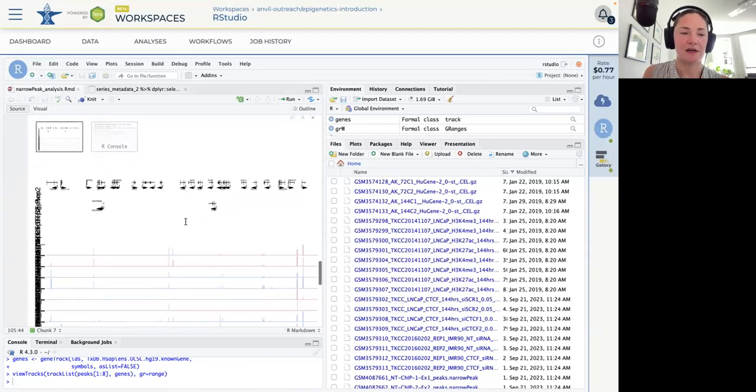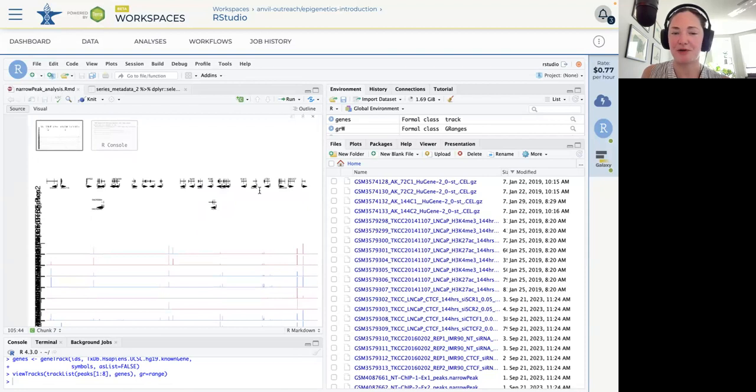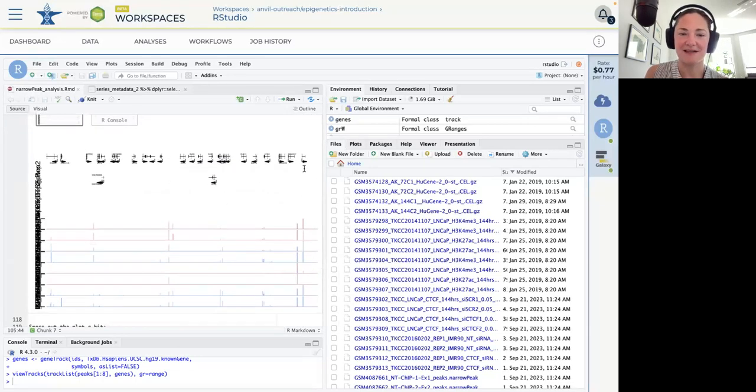Okay, so obviously this is pretty microscopic. It's a little hard to read, so maybe we want to zoom in on that a little bit. But I can see that there's some genes involved here. But the interesting thing is this set of peaks here is in a space. There's not a gene sequence right there, so that might be an important spacing region.